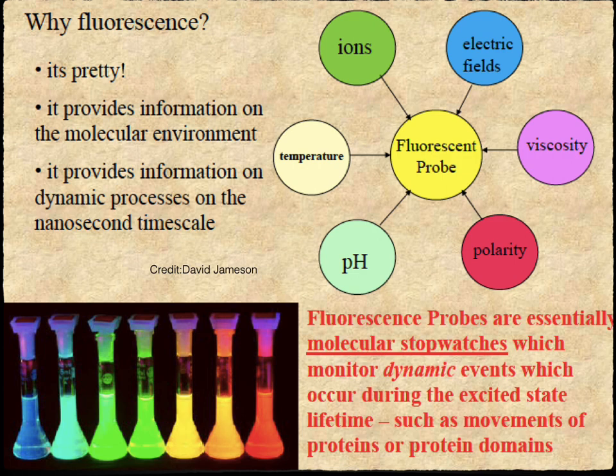Well, it's fine, it's pretty, a lot of colors, but the main issue related with fluorescence is that when you have your fluorescent probe attached to the molecule and in the biological system, this probe is able to sense flow of ions, temperature changes, pH changes, polarity, viscosity, electric fields, and many other agents around the fluorescent molecule itself. Yeah, it's pretty, it's brilliant.